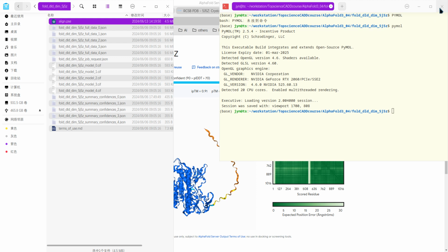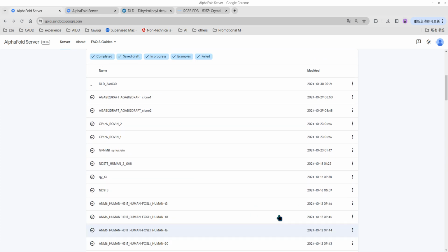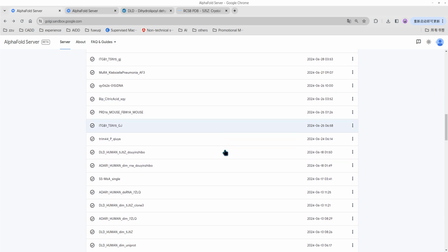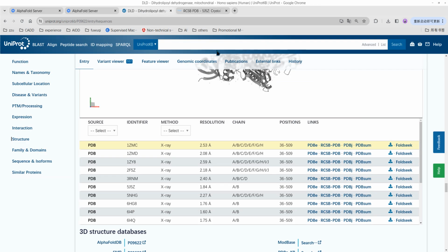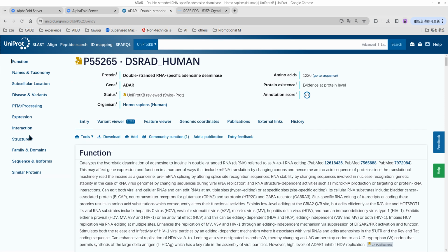The full name of PTM is the Predicted Template Modeling, and the full name of IPTM is the Interface Predicted Template Modeling. In this experiment, IPTM equals 0.91. IPTM measures the accuracy of the predicted relative positions of subunits within the complex. Values above 0.8 indicate confident, high-quality predictions, while values below 0.6 indicate that the prediction may fail. The IPTM value between 0.6 and 0.8 is a gray area, and the prediction may be correct or incorrect. Judging from the IPTM score, the relative positions of the subunits in this experiment are relatively accurate.